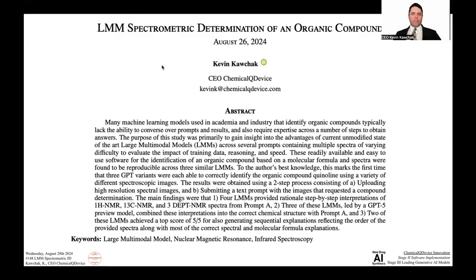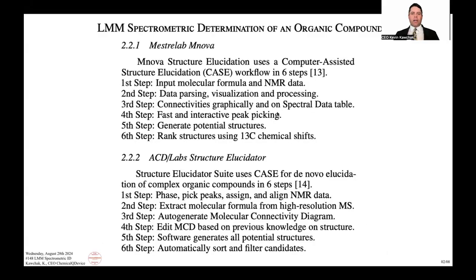And I really want to focus on this one because in the previous manuscript, I was able to prove that I could take image clips of reactions and the AI software would suggest new ones, or even a spectrum. Actually 3.5 Sonnet, a Claude model, did quite well with that last week, and it would then analyze these spectra, or even something deep inside the text. This specific study really focuses on images, specifically spectral images, the spectrum you obtain when you run a proton NMR experiment, or C13 or IR spectroscopy.